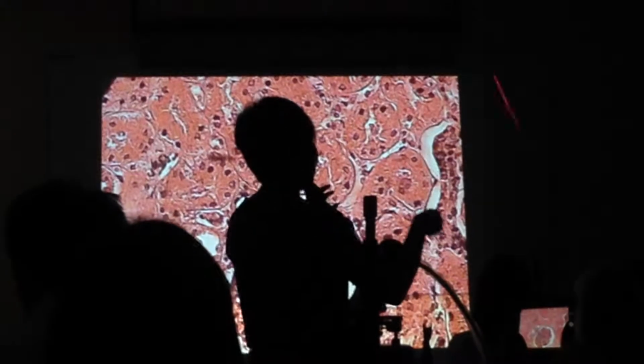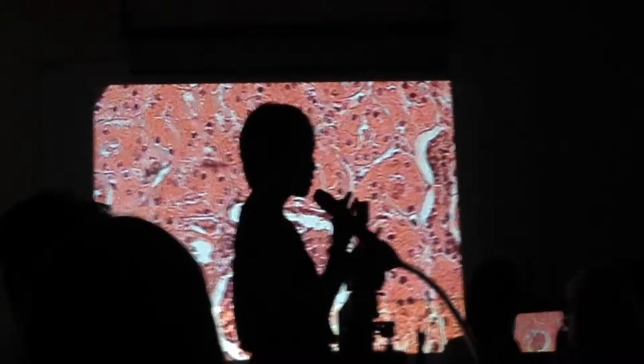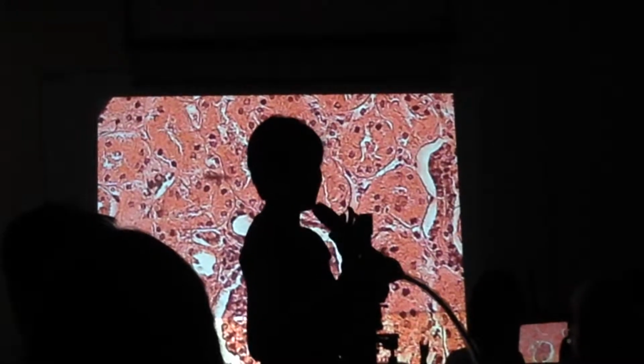This is because you have cellular swelling. You have accumulation of fluid within the cytoplasm. That's why the lumen becomes smaller or altogether disappears, like this one. And then the nuclei move their position towards the lumen. So those are the subtle changes that you see in cellular swelling.